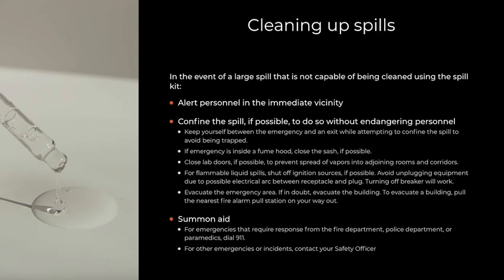Cleaning up spills is crucial to ensure the safety of all personnel and the facility. In the event of a large spill that is not capable of being cleaned using the spill kit, the following steps must be taken. Alert personnel in the immediate vicinity. Confine the spill, if possible, to do so without endangering personnel. Keep yourself between the emergency and an exit while attempting to confine the spill to avoid being trapped.